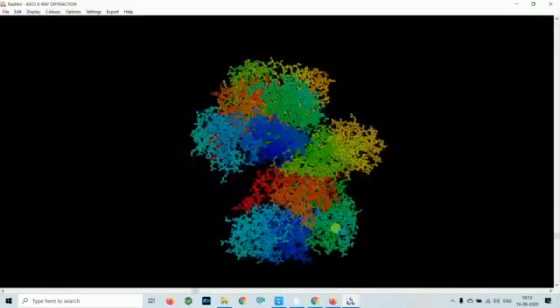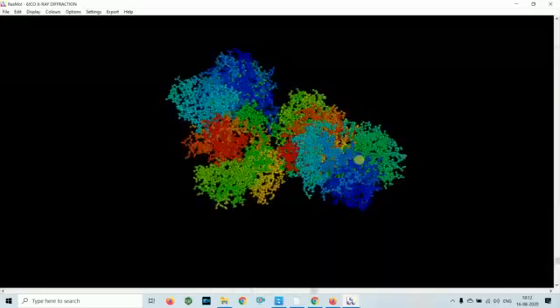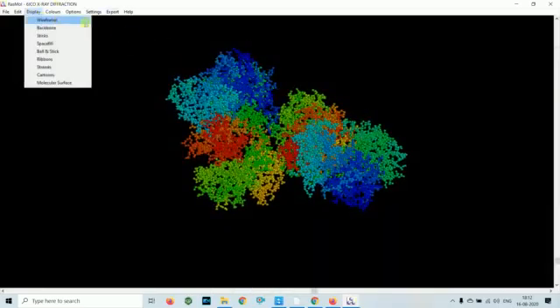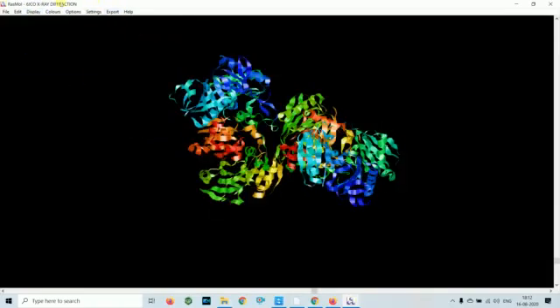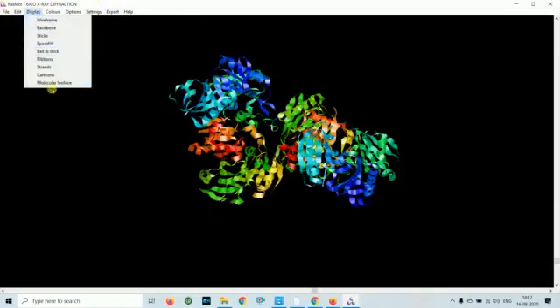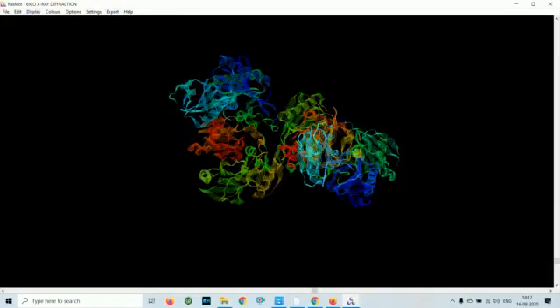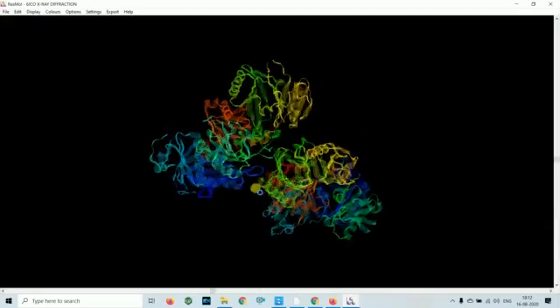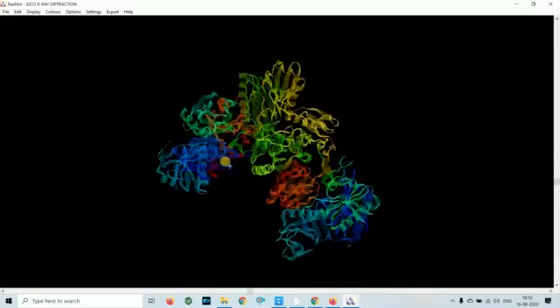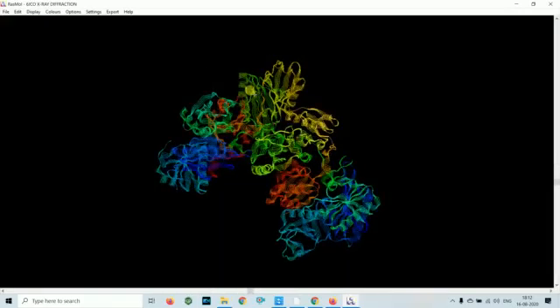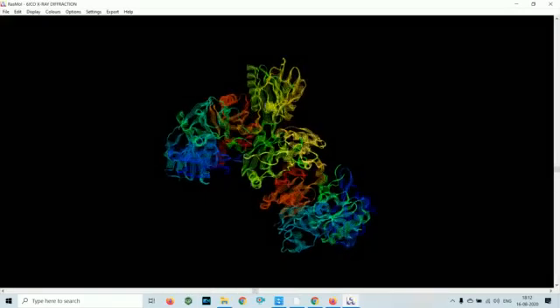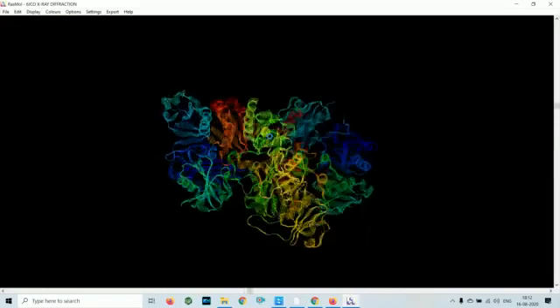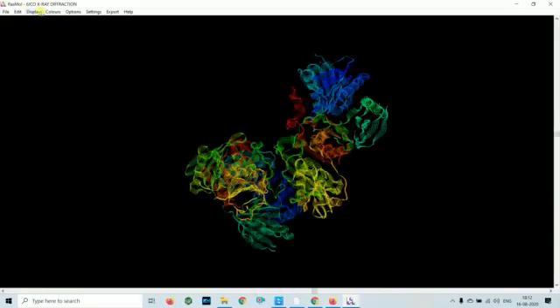You can click on ribbons and strands so you can see the structure: alpha helix, beta sheet, and these structures. Then cartoons—this is the cartoon structure. Apart from this, you can also find out the distance between atoms.